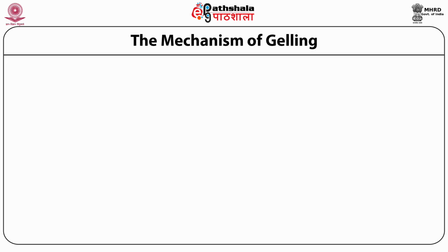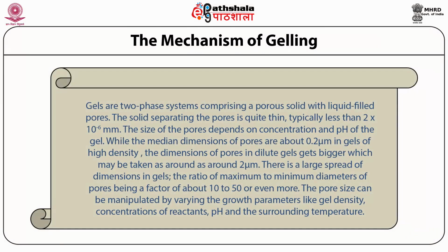The mechanism of gelling. Gels are two-phase systems comprising a porous solid with liquid-filled pores.